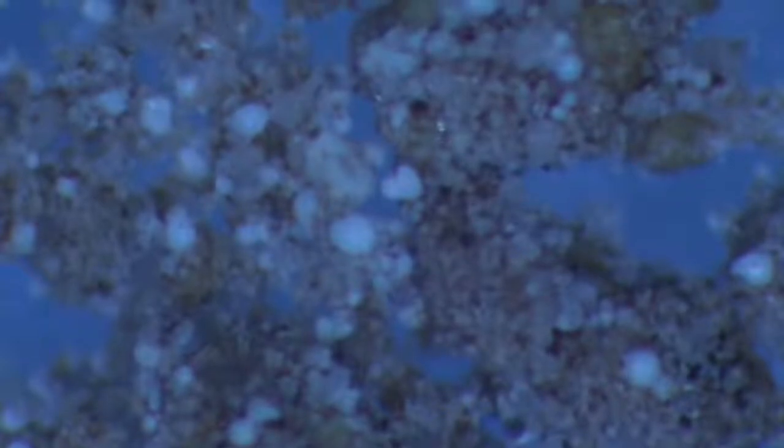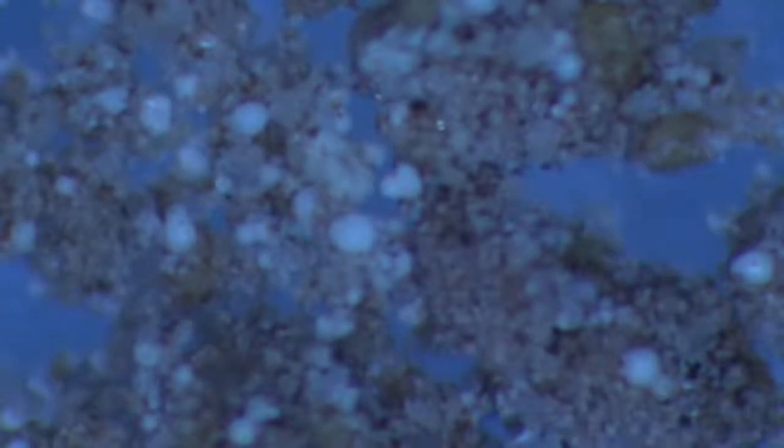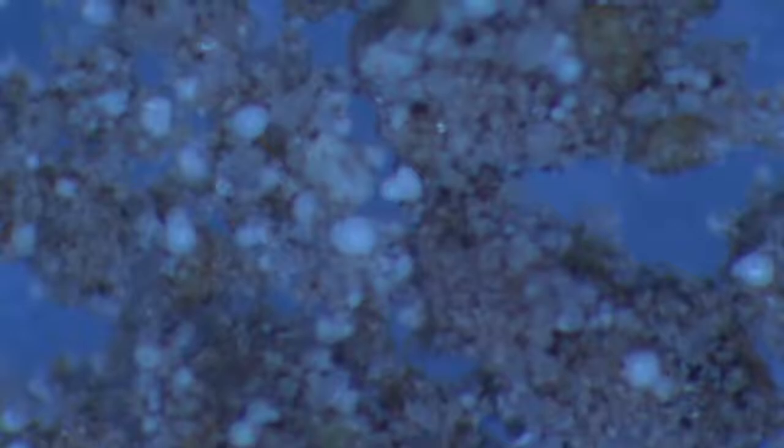So it's a long view, very heterogeneous. Close up. Very dense, so light doesn't penetrate very much. Funny how the milk granules are kind of oblate, spheroid type things.